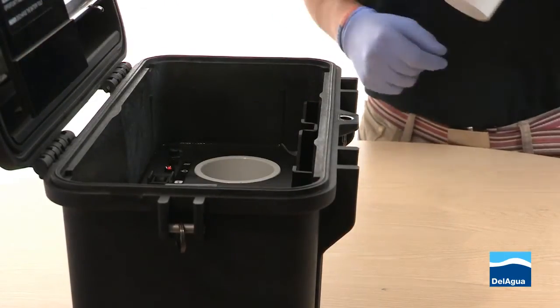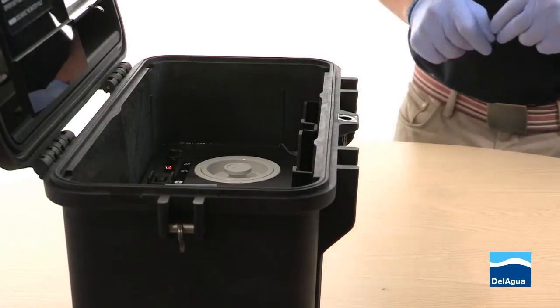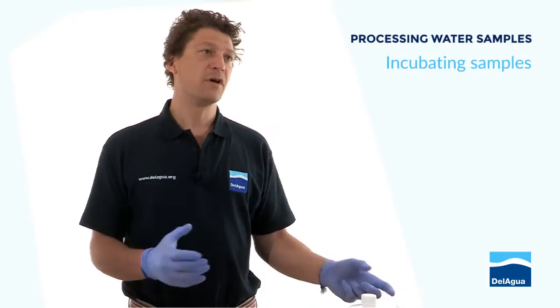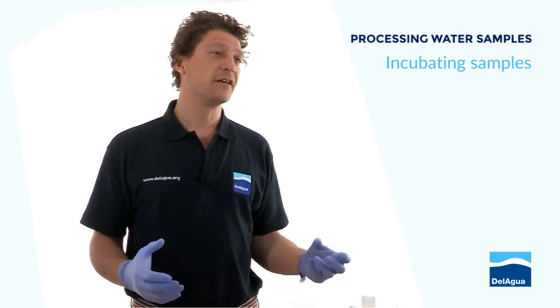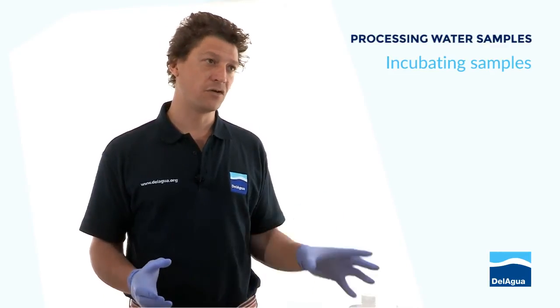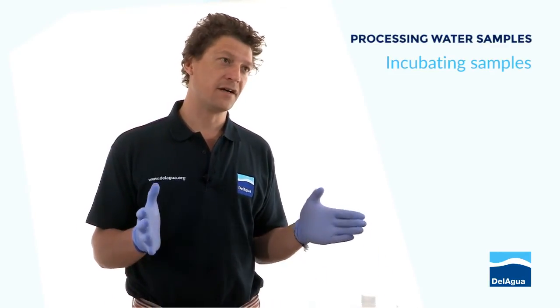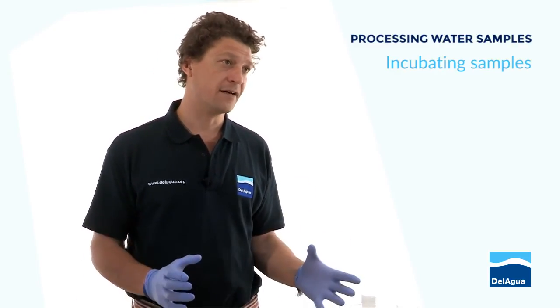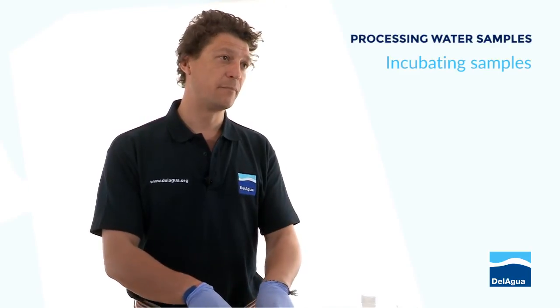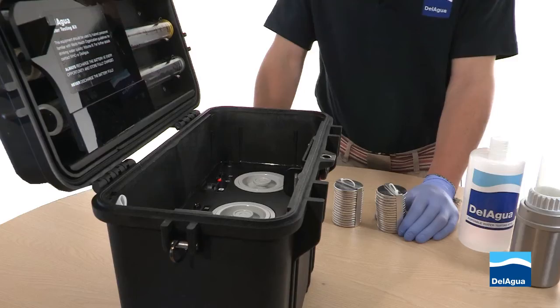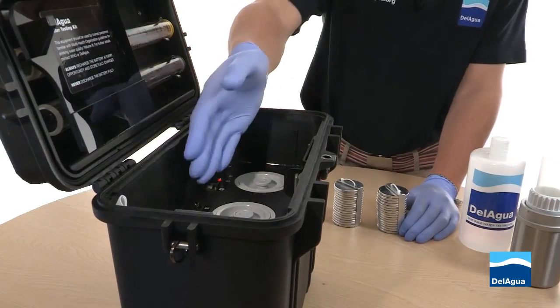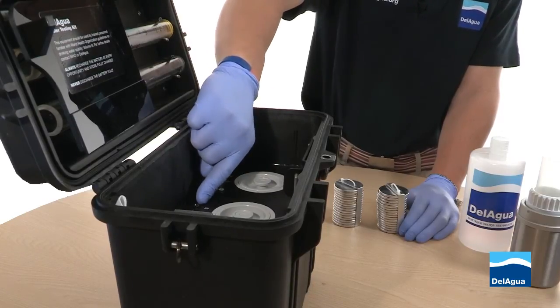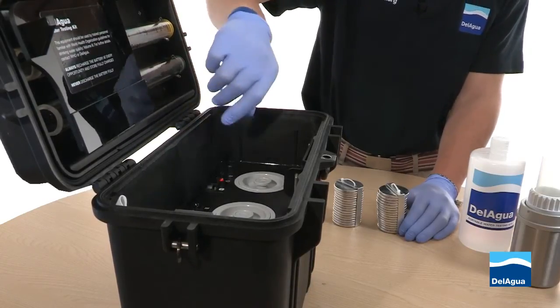Place them into the top of the incubator unit and return the lid. In the circumstance whereby you're using a dual unit, there are two principal advantages. The most common is that it allows you to simultaneously incubate for total coliform as well as isolating by temperature for thermotolerant coliforms, which reduces your analysis time. The other advantage is that if you want to incubate both chambers at the same temperature it gives you added capacity. Ensure that both incubator units have been turned on, the power light is showing, and the temperature light has extinguished, showing that the incubator chamber has come up to temperature.